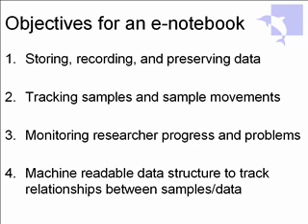Students can usually find their own data given a day and a half to pull it out of some computer somewhere, but I want to be able to find it even if I don't know what their email address is anymore. It would be nice, the work I do, a lot of what we do is quite high throughput, or we're developing high throughput systems. It's very nice if we could embed into this a system that would track samples so that we know which sample was what.